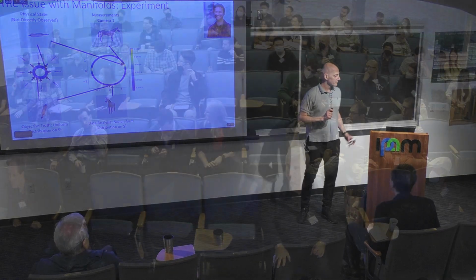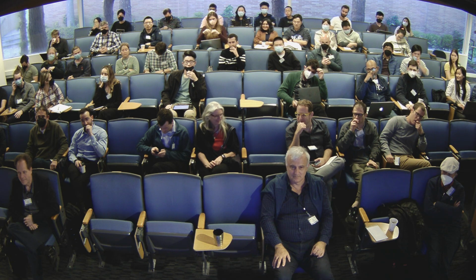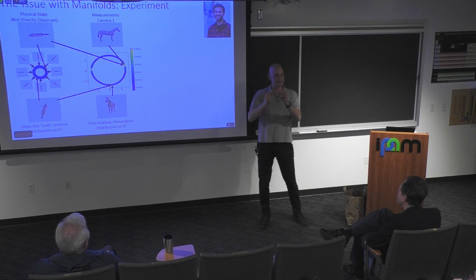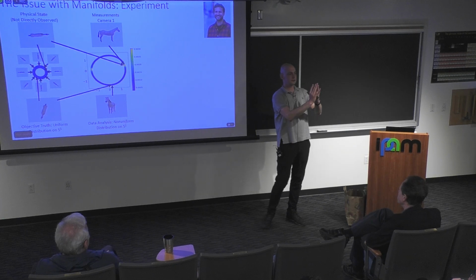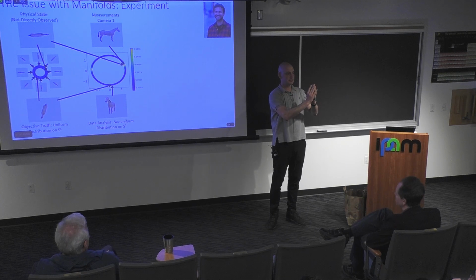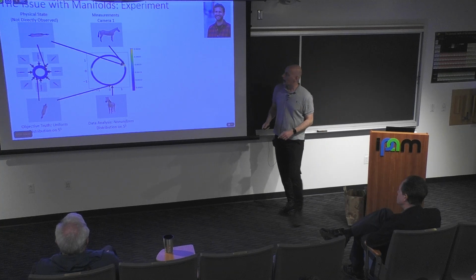Just a very short question. What is the distance measure that you assume? That's extremely important. So in here, the measure that we assume for distances between images is just the L2 distance between images. But that's an extremely important point. I'm going to get back to it in a moment.